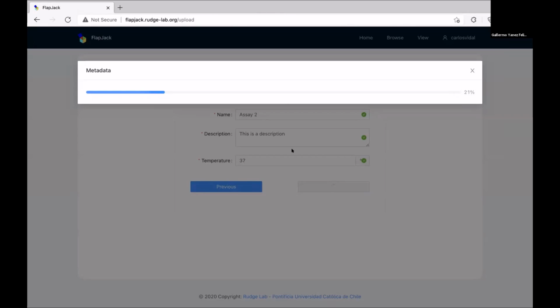Yeah, in the same lines, we can add different machines to this pipeline. If you're willing to use Flapjack, we can help you to automate this process for your machine. In terms of code, what we will need for featuring new machines would be having the parser. So we have the file from a specific machine, and then we need to write the parser of that information in order to store it in a database.